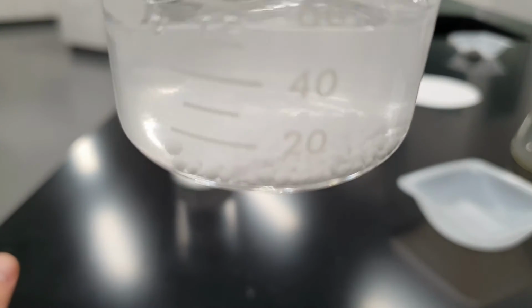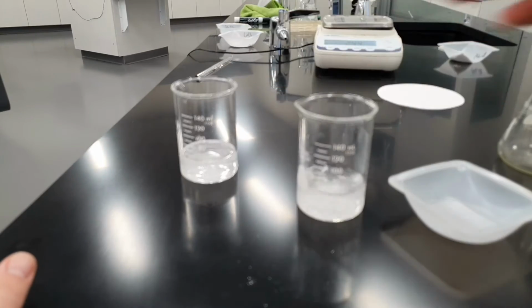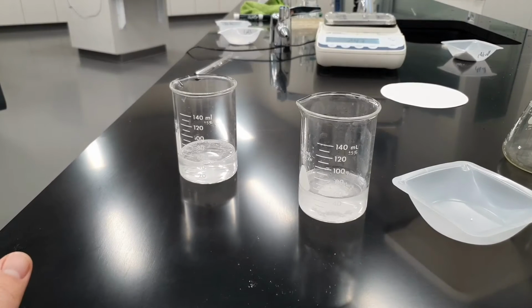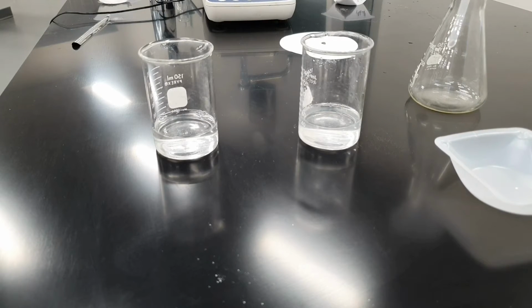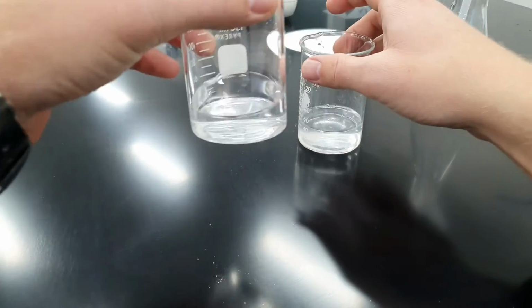So again, already we're seeing some of those dissolving, some of those particles going into solution here. Okay, so we're going to go ahead and stir those for a second, and we'll be back when these are both dissolved. Okay, here we are back after these have been stirred a little bit longer, and what we see is we have 2 solutions that were actually soluble.